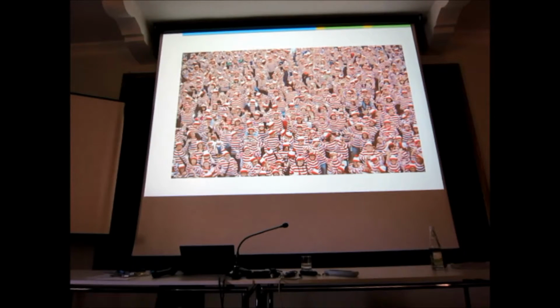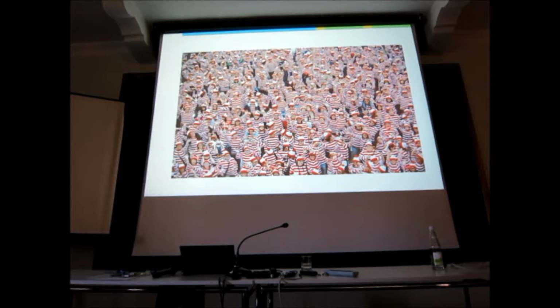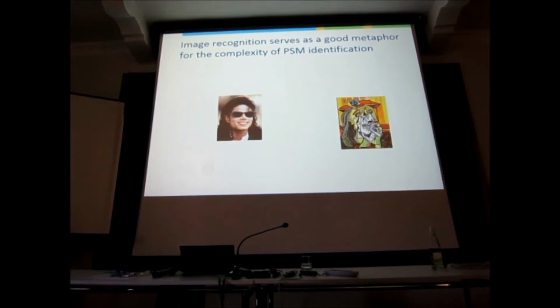So, now there's lots of Waldos. And that is the problem. So let's go into the problem in a bit more detail so that you understand and that I can give you a second thing that's on our very close horizon that will make our life difficult. It's the reason why FDR estimations fail in these big databases and in a lot of other cases. This is target decoy searching.